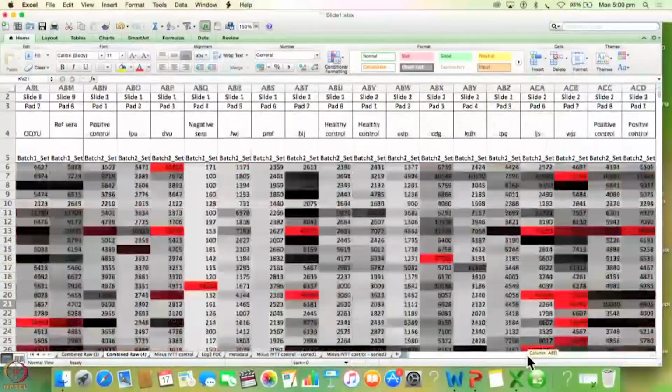I am sure you all know. For this I am only going to show you the steps. The first thing we do is set a floor of 100. What we are saying here is that all the samples which are below 100 are going to have a value of 100. So this is going to remove all the negative values from my data.